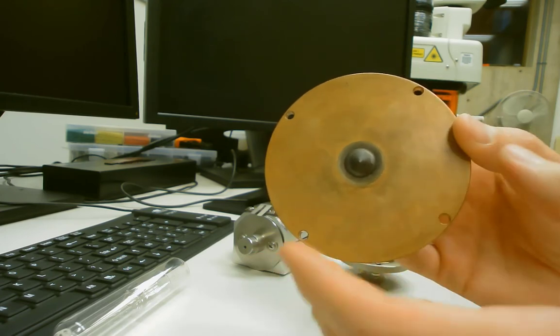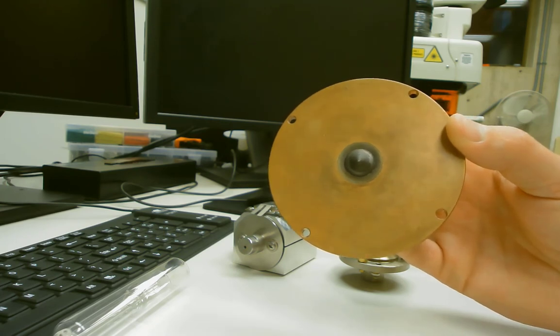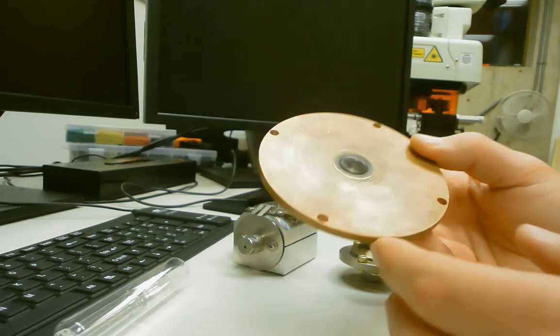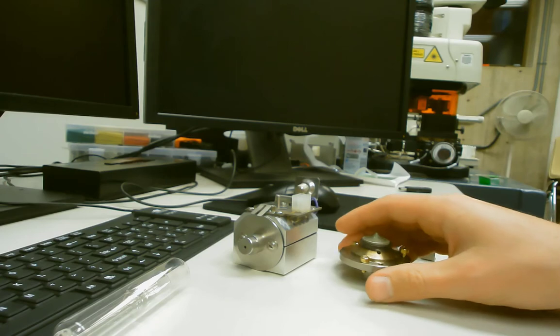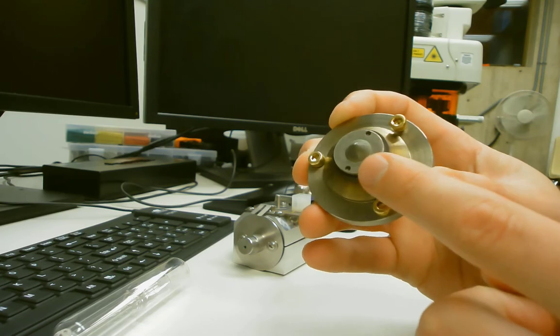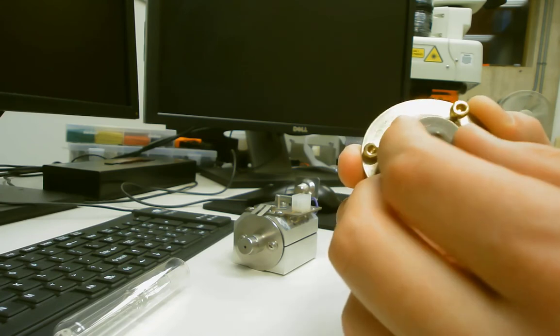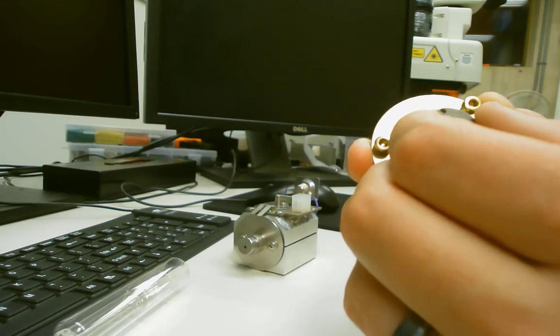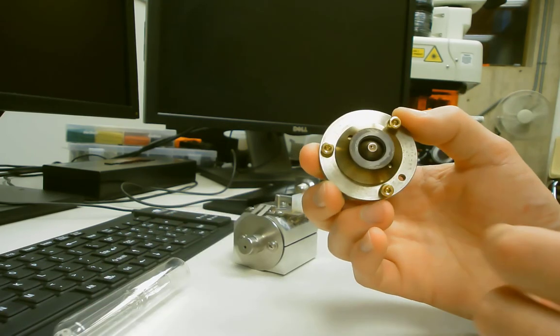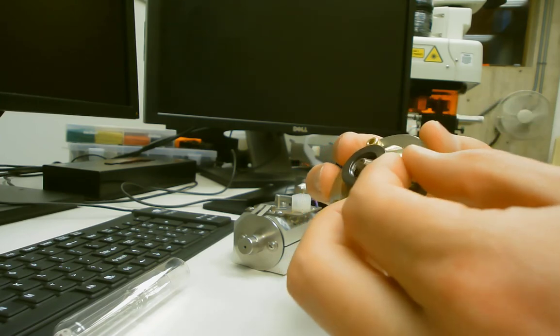And the whole point of the tiny hole is to give us an interface to the vacuum, as well as to skim off any excess of the sample stream that we don't want, which might be colder or full of polyatomics or interferences or things like that. Then directly behind that cone is the skimmer cone. It's also made of nickel, but again, it's tarnished, and it screws into this lens stack here. This one has an even smaller orifice. I think it's 0.5 millimeter, and it's much more fragile. So again, with ones that are in use, we really don't try and handle them except for maintenance and cleaning.